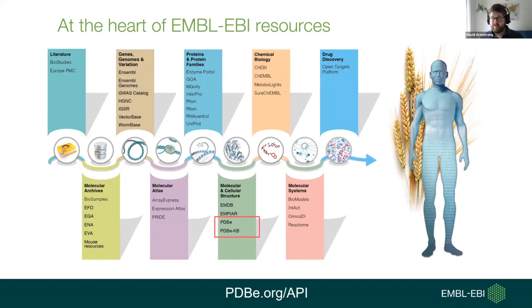One of the other benefits of PDBe is we are part of EMBL-EBI, and that means we have a whole host of other resources providing biological and chemical information that we can link to and work with to hopefully provide a more coherent explanation of the science that's going on in protein structures, and to provide you with more information through that as well.